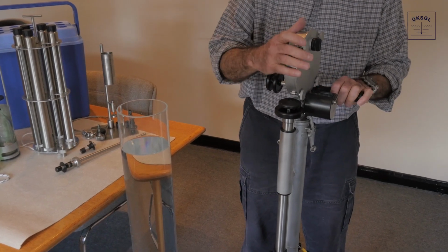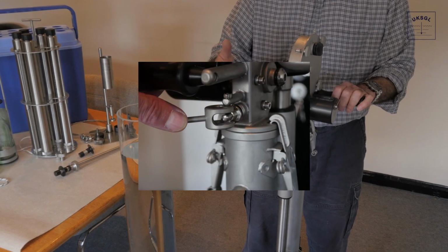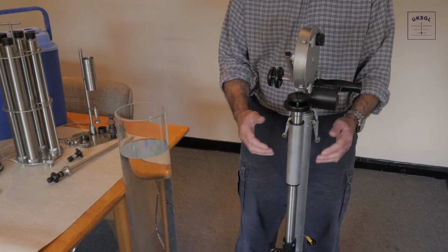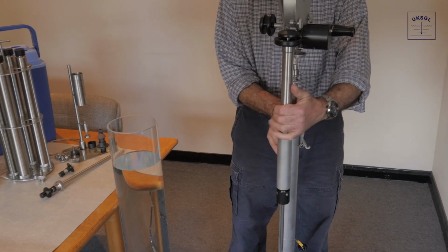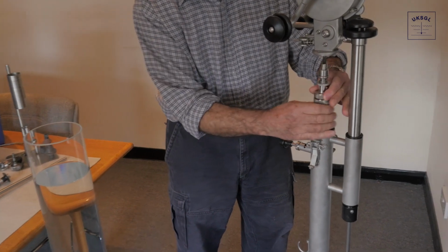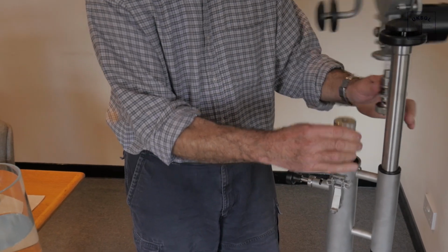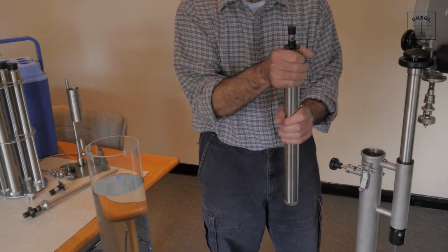As per standard operating procedures, the winder knob is pressed to wipe the liquid off the winder tape as it reels back into the winder housing. Once the tube is back in the winder barrel, standard operating procedures are followed to retrieve the sample tube. The tube is unscrewed from the winder key. The tube is now turned upside down so the probe can be removed and replaced with a black cap.